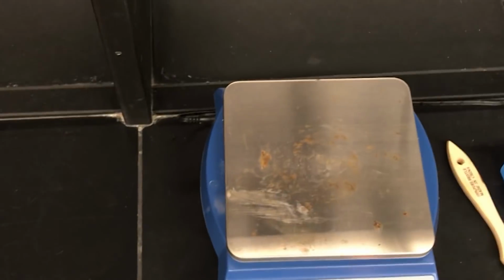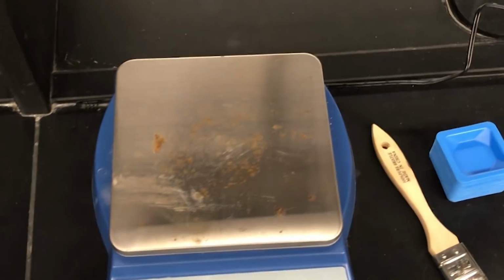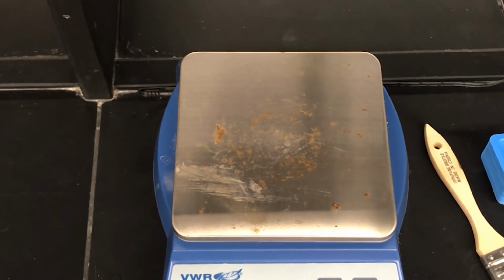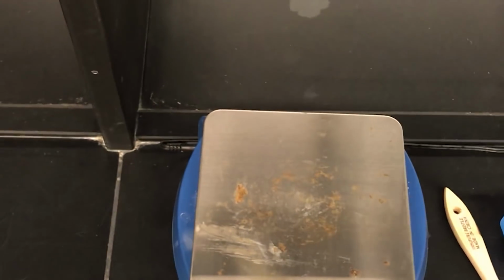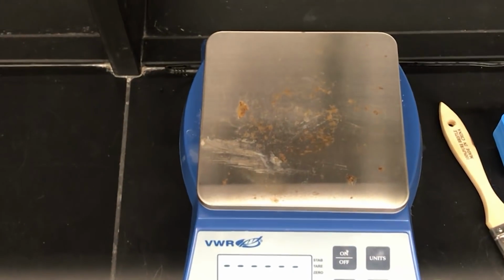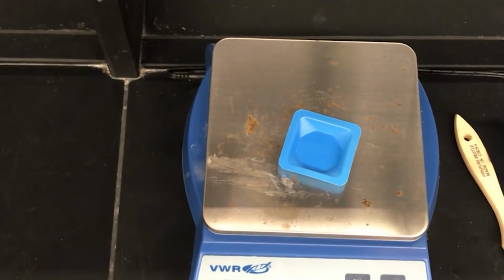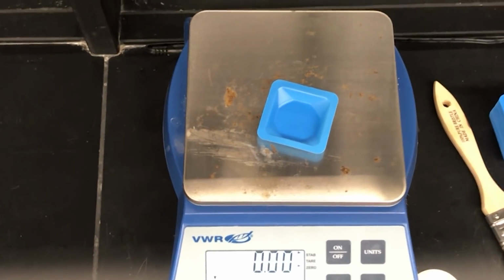Now, my first experiment is going to be using, I'm going to turn on my digital balance. I'm going to put my weigh boat on the scale. I'm going to press T to tare it. Okay. Now, I'm going to get my sodium chloride solution, which is right here.